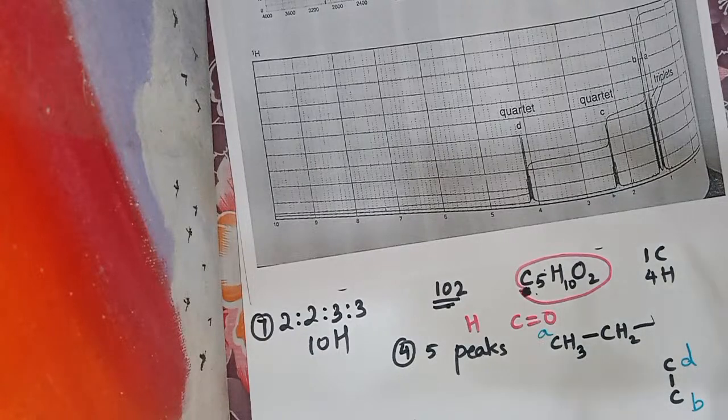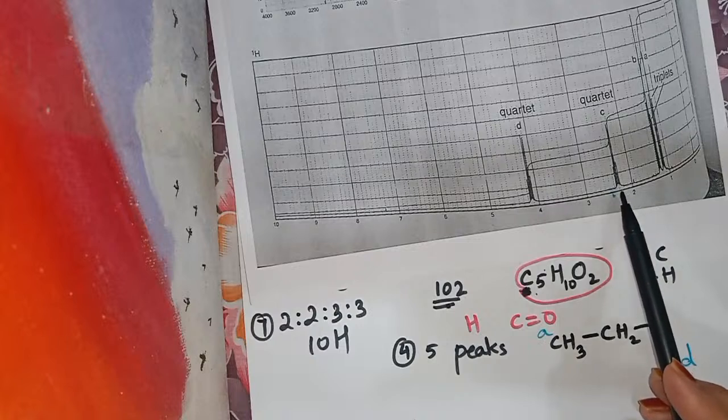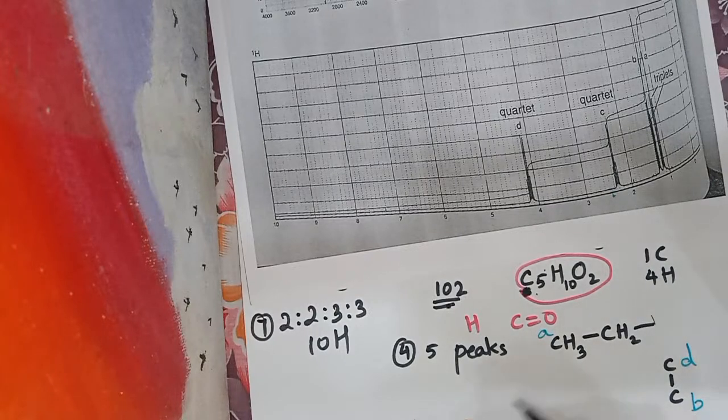Now the quartet at C, it is having 2.4 ppm.